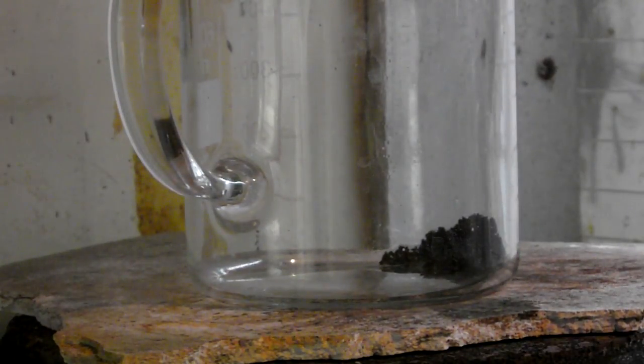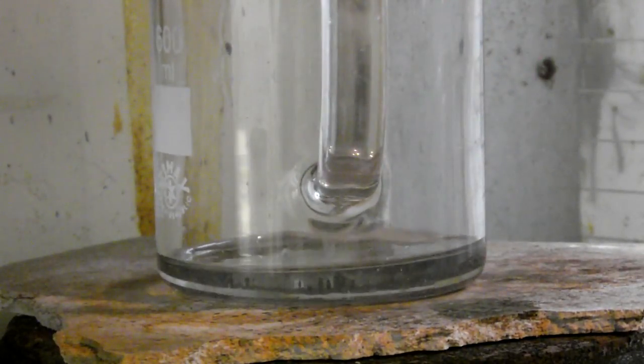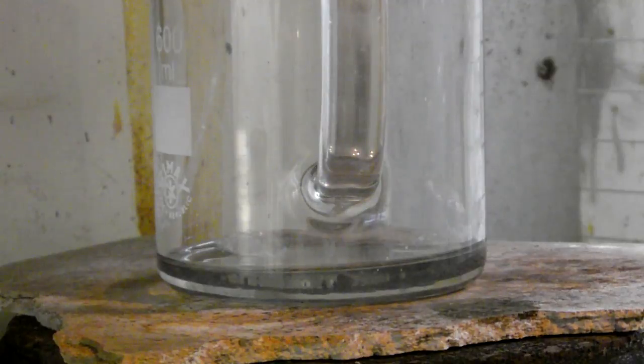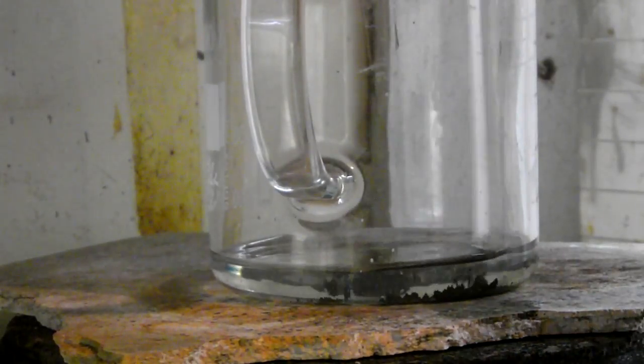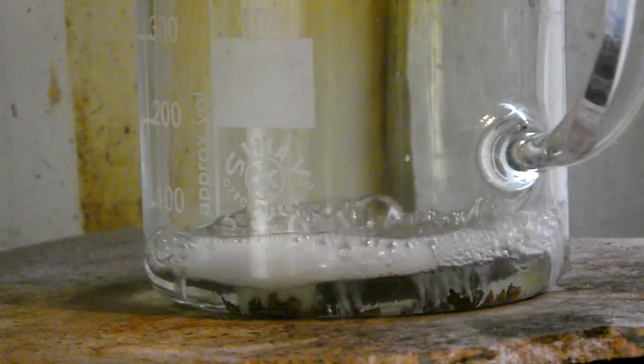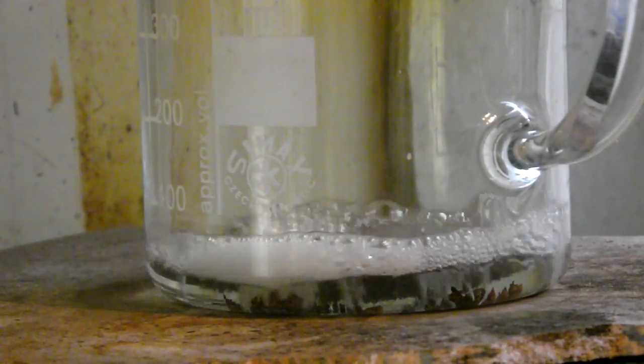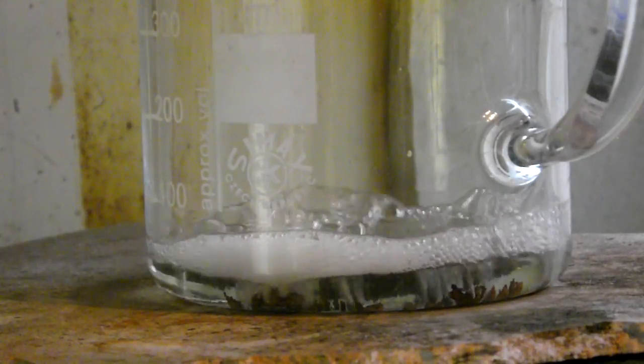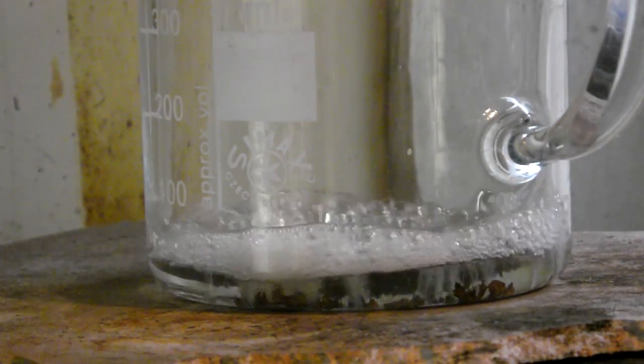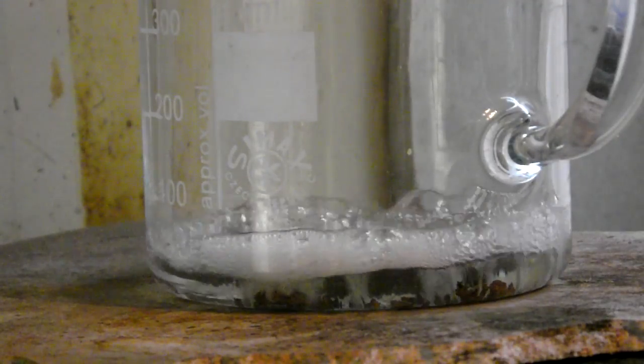The black residue in the beaker is covered with concentrated nitric acid and set to boil for a couple of minutes. Gold clumps together and changes color from black to tan.